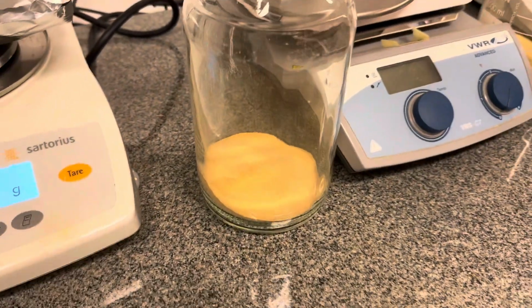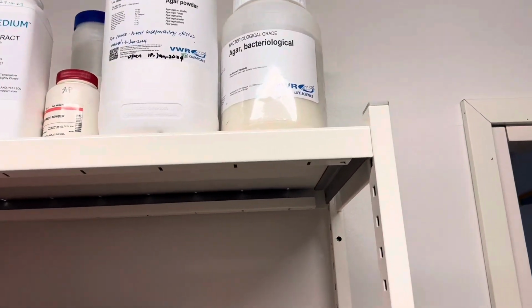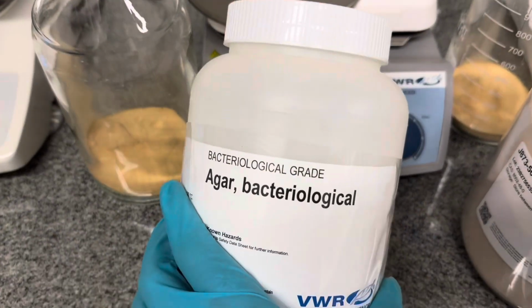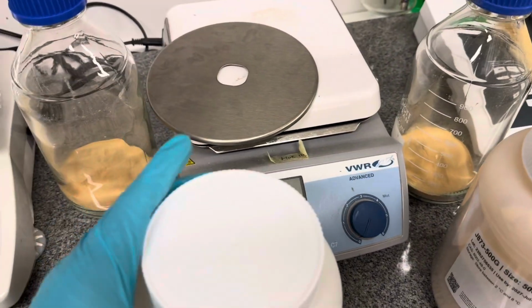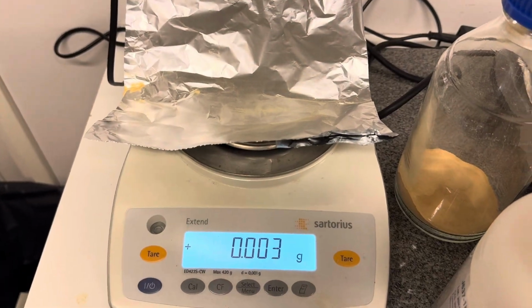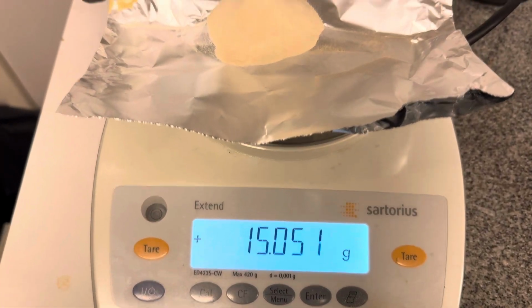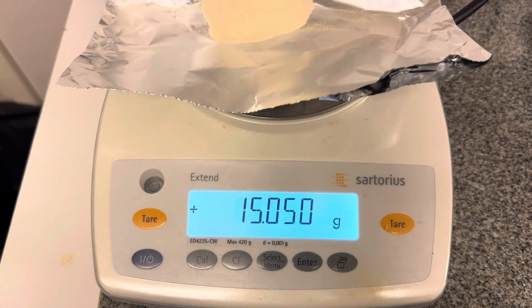Okay, now that I have put the malt extract into these bottles, I have to take 15 grams of agar to mix into that bottle. So I can take this. This is the agar, as you can see. And I will measure 15 grams on this sheet. Okay, now as you can see, I have measured 15 grams of agar. It's a little bit above, but it's okay.